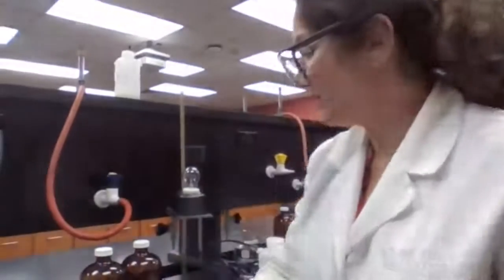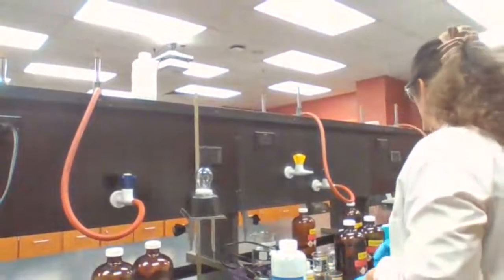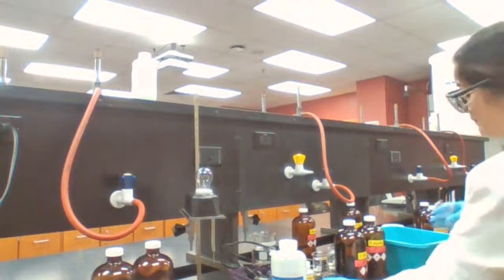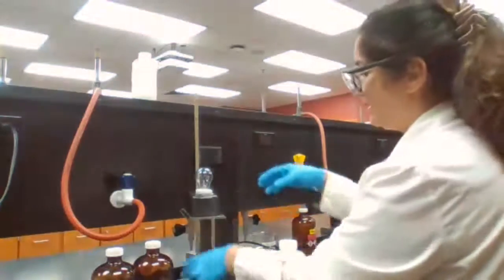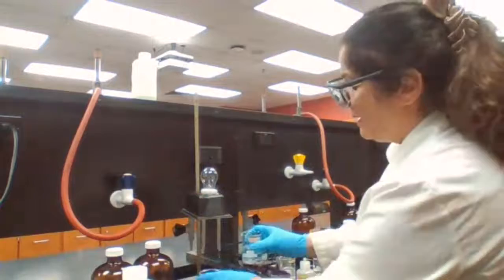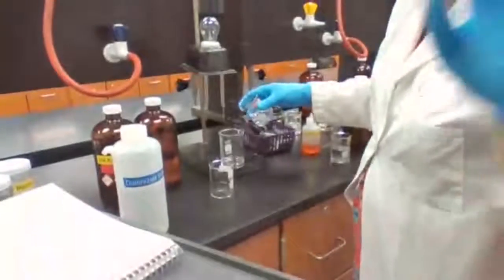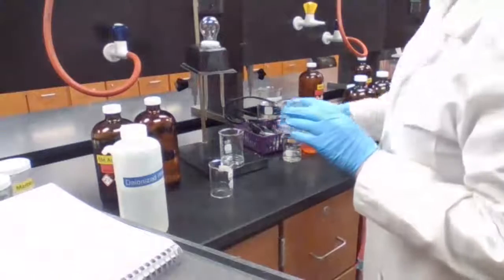Ionic reaction. HCl and NaOH, both of them we tested and they were both electrolytes. Now we're trying to find out what happens if we mix NaOH with HCl. What do you think? Okay, mixing HCl and NaOH.